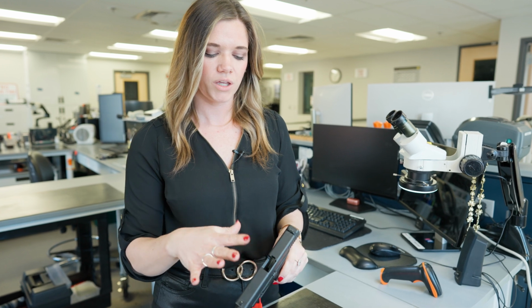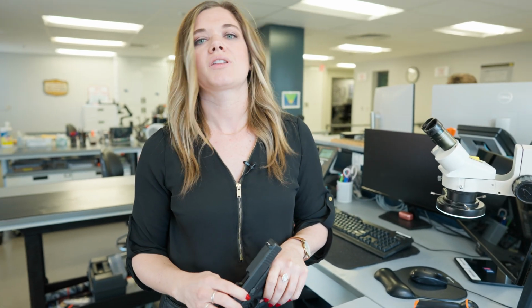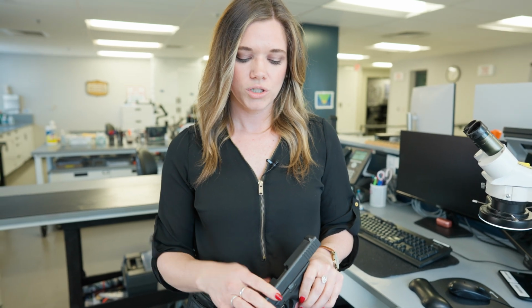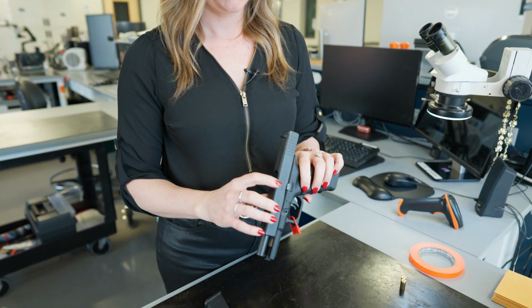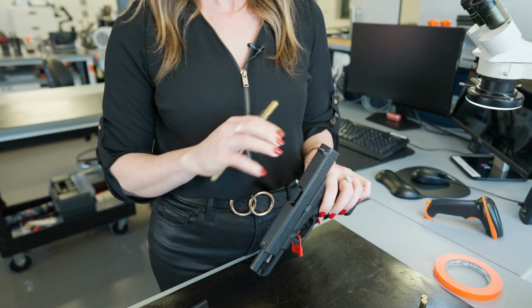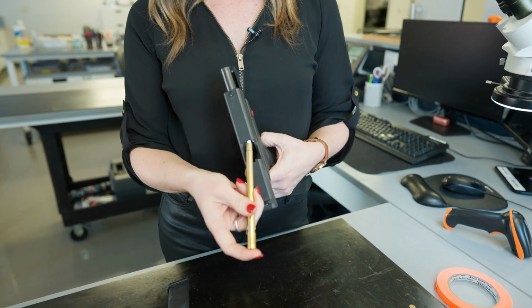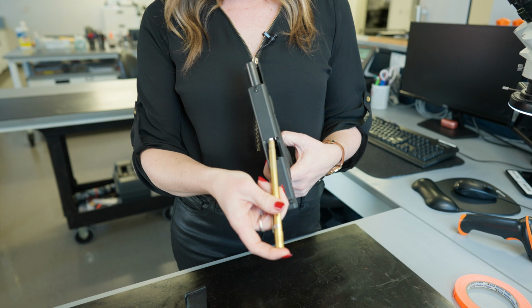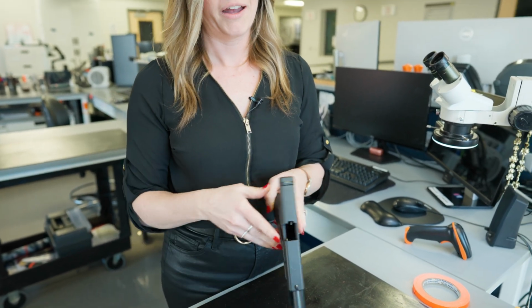When a firearm comes into the lab, our examination process begins with first photographing the firearm and the contents of the packaging, and then making sure that the firearm is safe. We do that by ensuring that the magazine is out of the firearm, that there are no rounds in the chamber, that the magazine well is clear, and that there are no items in the barrel. We are probably the only people in the world who look down the barrel of a firearm, but we always stick something in the chamber before we do so. That way, in case there was something in there, it is not going to be capable of firing.